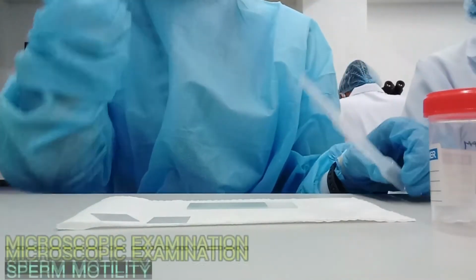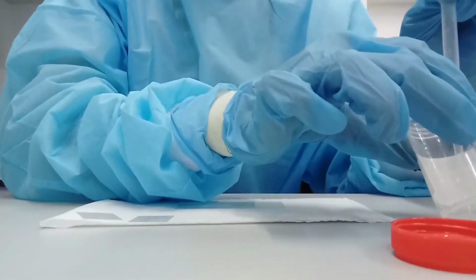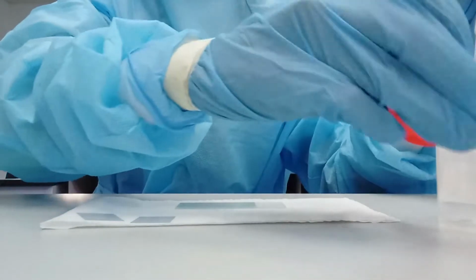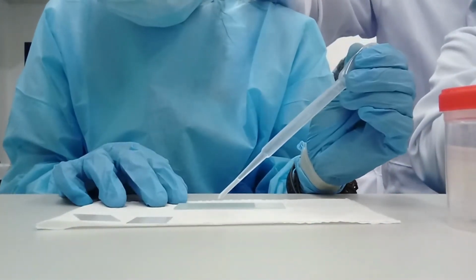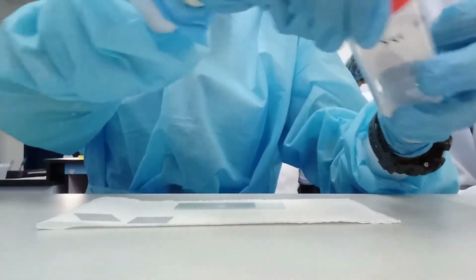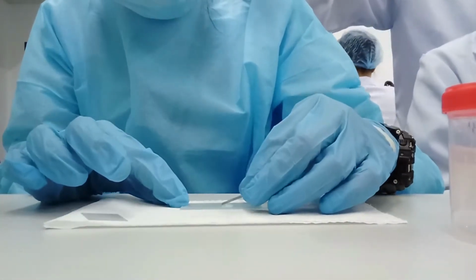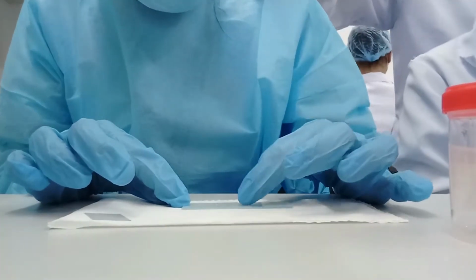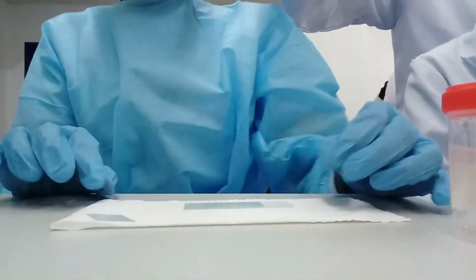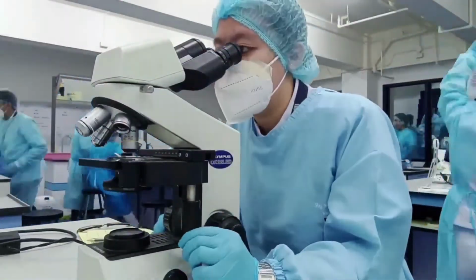In the microscopic examination of the sperm, begin with examining the sperm motility. First, prepare a slide for examination. Place 1 drop of semen sample on the slide and then place a cover slip on top of the drop. Now, proceed to microscopy. The sperms of the patient have 80% motility.